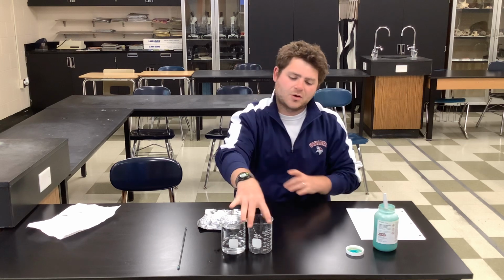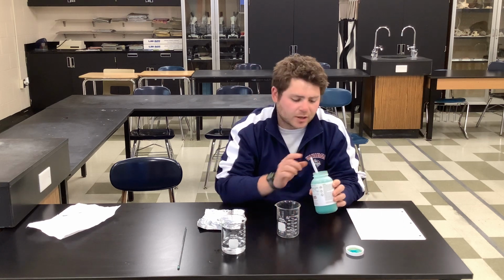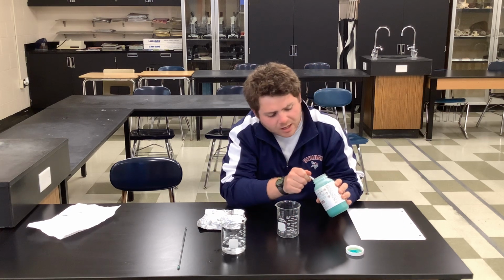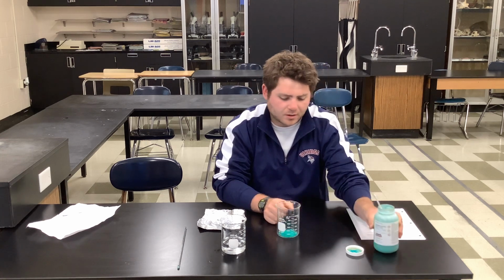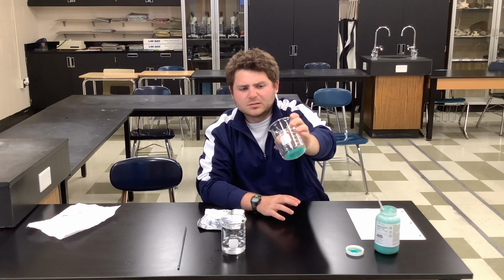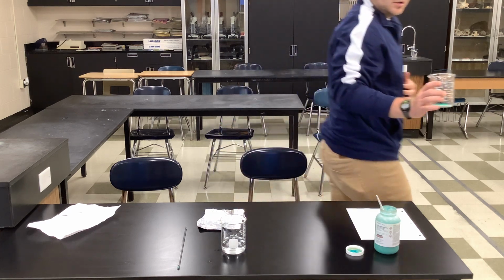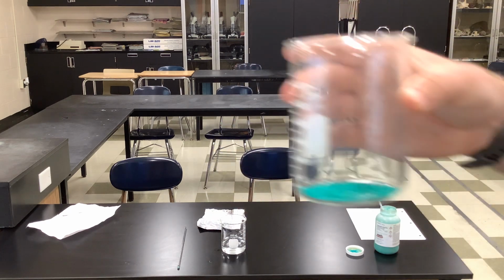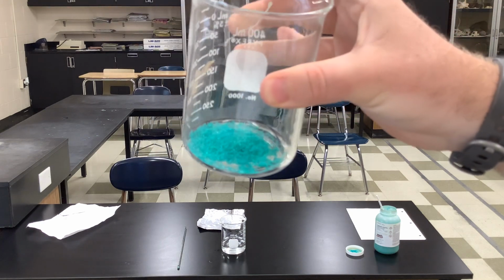How it works is I want somebody to come up, if you're in school, and I will give you some copper chloride in a beaker, okay? So I'll take some copper chloride and I'll put it in the bottom of the beaker. All right. I want you to observe what it looks like. It's a greenish, bluish color. Okay. I'll come a little closer for you guys so you can see it. This is what it looks like, a greenish, bluish color. Okay.